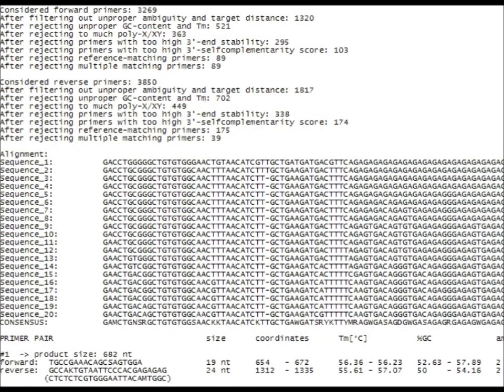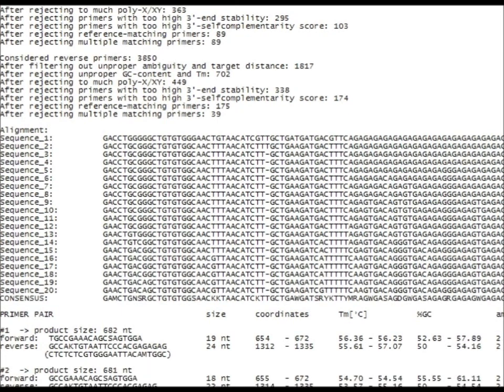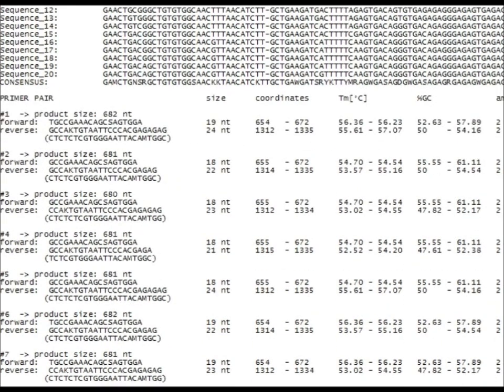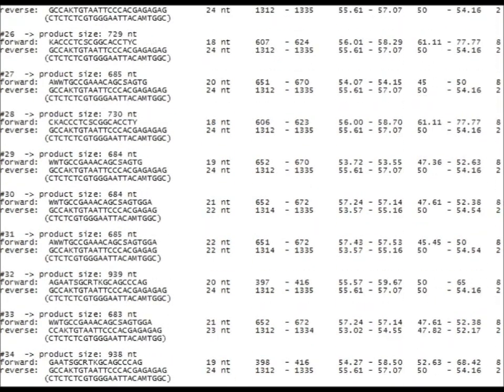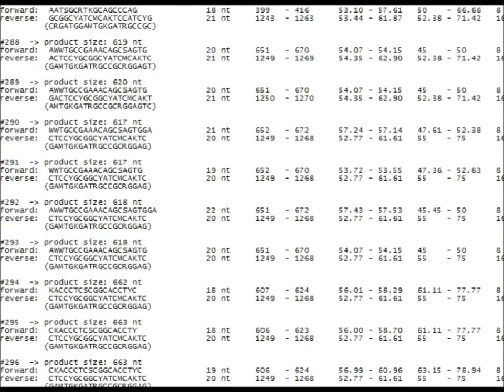The textual output contains some additional information like the number of candidates that passed each test, and of course a list of suggested primer pairs with PCR product size, primer length, primer coordinates within the alignment, melting temperature, GC content, and the degree of degeneracy. Primer pairs will be sorted in ascending order according to their combined degeneracy.